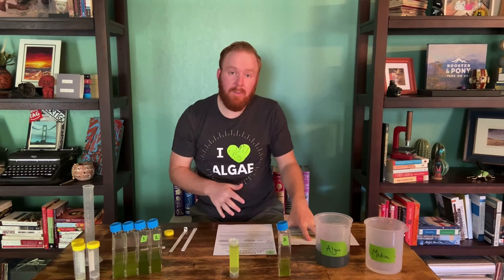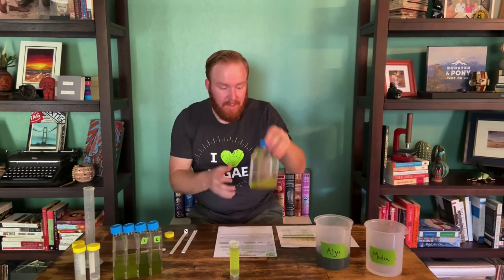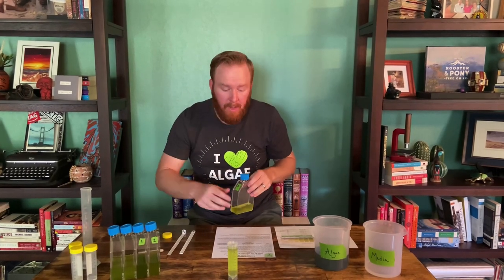That's how we're going to use the SecchiStick and the biomass estimator to figure out how much algae is actually in our culture. We're going to do this a couple of times on day two and day four. And that's all you need to know. Thanks. Bye.